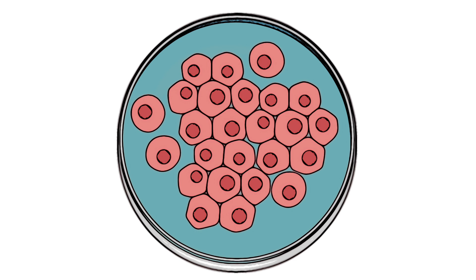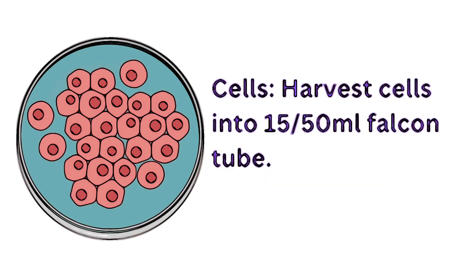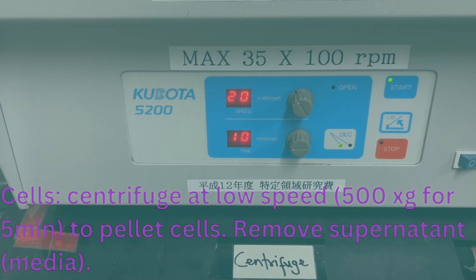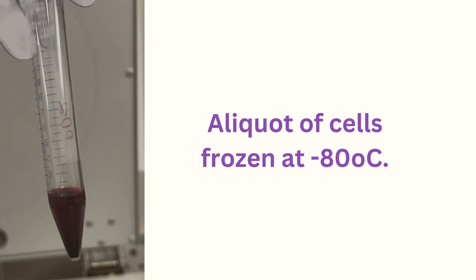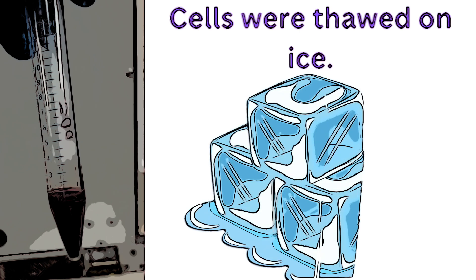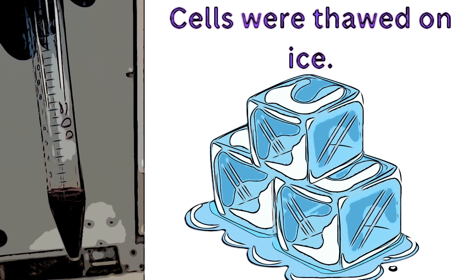You want to start off by harvesting your cells, and it's usually a great idea to put the cells into a 15 or 50 mL falcon tube, because you need to pellet out the cells before we can go on with the next step. Sometimes you may be starting with cells that were frozen previously — that's fine, you can also use frozen cells in RNA extraction using TRIzol. Go ahead and thaw the cells on ice until fully thawed.